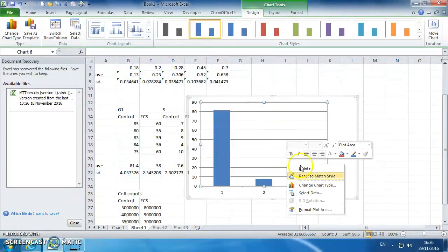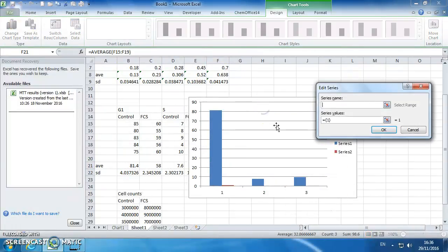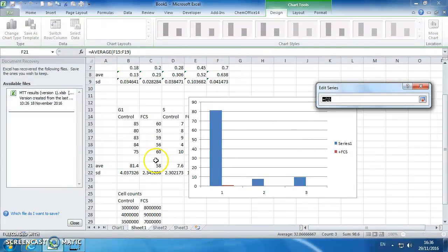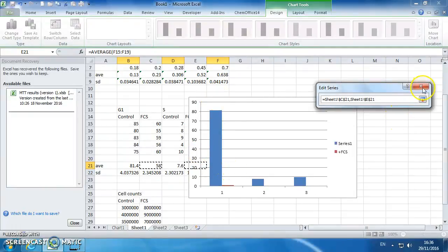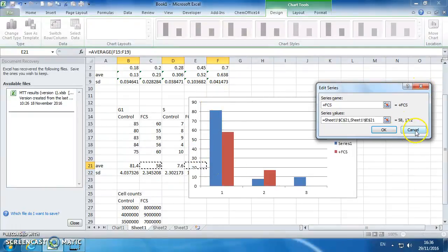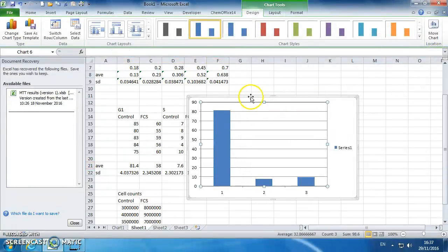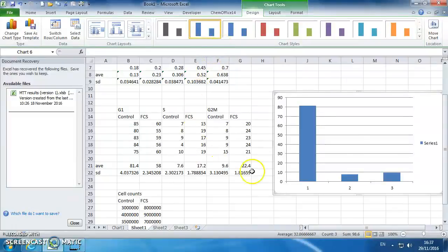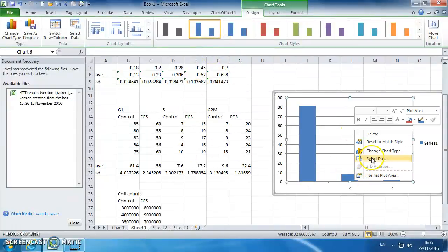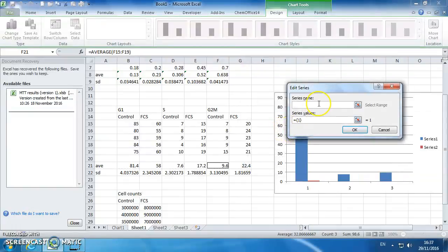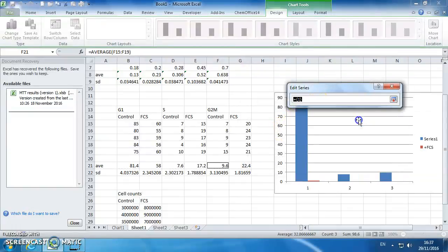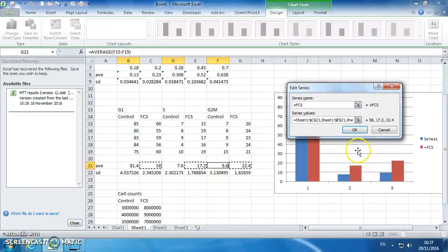Right click and go to select data. Add a series, and this is going to be your plus FCS. Highlight your data values, which is that one, probably that one, and one that's hidden behind your graph. So I just need to cancel that and move the graph out of the way. So I'll repeat that. So right click on the graph, select data, add a series, plus FCS. Series values are my FCS ones, which is that one, that one, that one. So we've now got a two series graph.